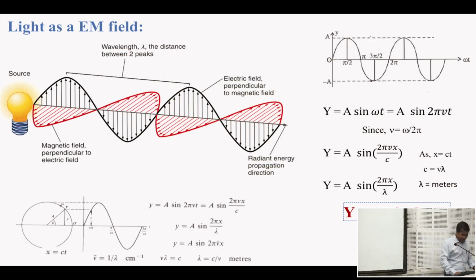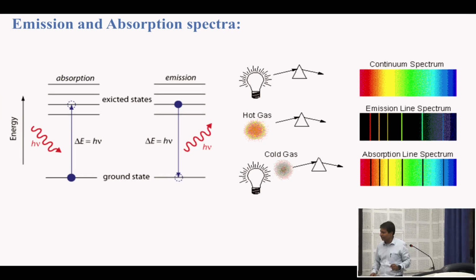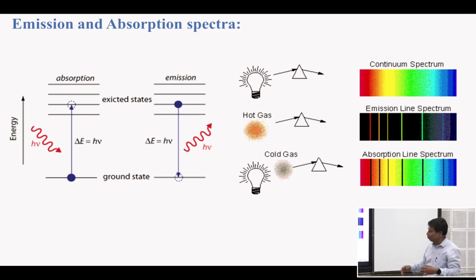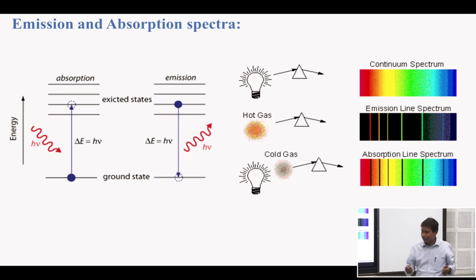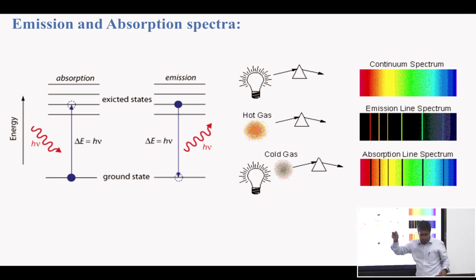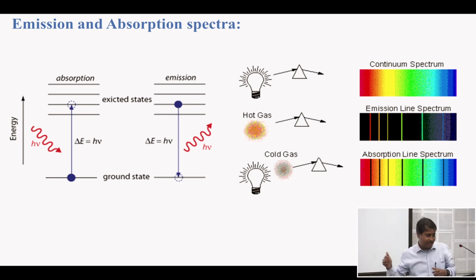So this is already discussed, and this one I usually tell the BSc students to understand. What is absorption, emission, and how to visualize that spectrum. Spectrum, you see, this is your light source. Spectroscopy always means light-matter interaction, as he has said nicely.